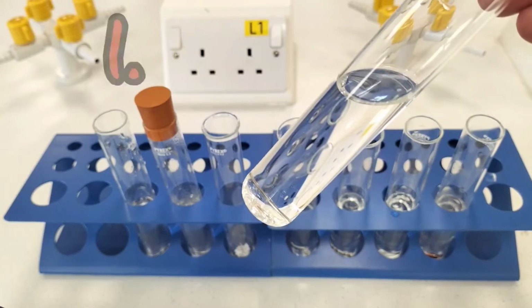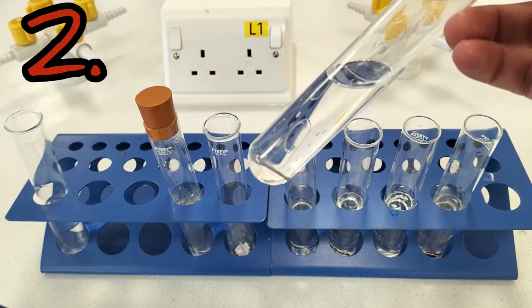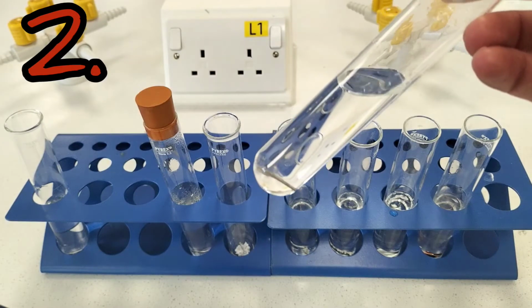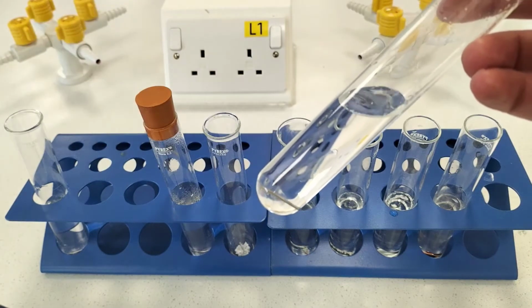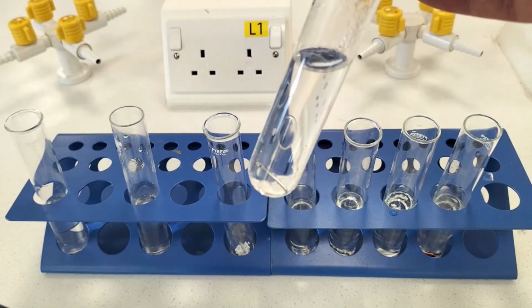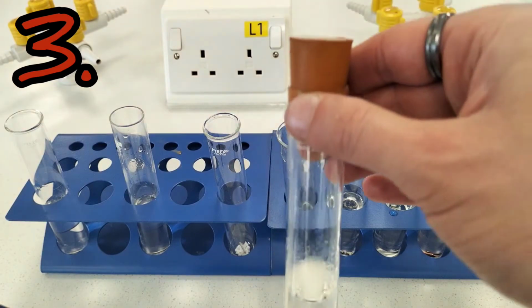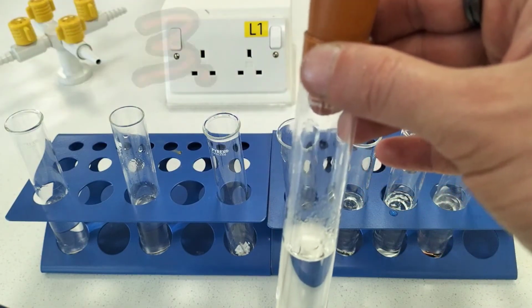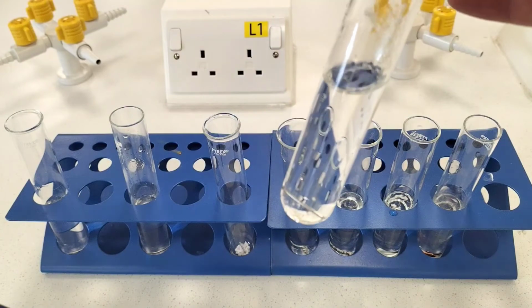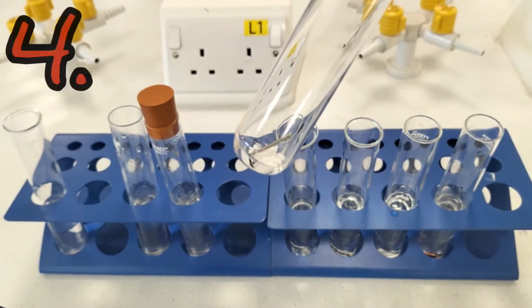open to the air. Experiment 2 may look identical, but actually I've dissolved a pinch of salt into the cold water to simulate seawater or salt water and the effect it would have on the rate of rusting. Experiment 3 contains freshly boiled water around our iron nail. And I've also sealed this boiling tube with a bung to prevent any air getting in after I sealed this boiling tube. Experiment 4 contains no water.